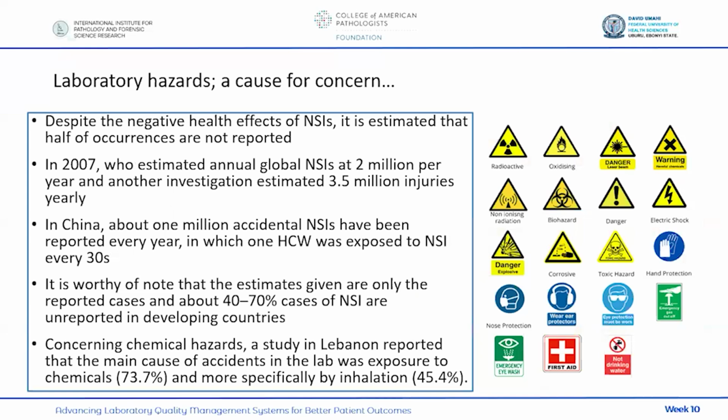Now, despite the negative health effects of these needle stick injuries, it is estimated that half of occurrences are not reported. This does not come to us as a surprise. We know that. In our last discussion, we mentioned that things happen in the laboratories, occurrences happen, they are not documented. And because they are not documented, they are not reported.